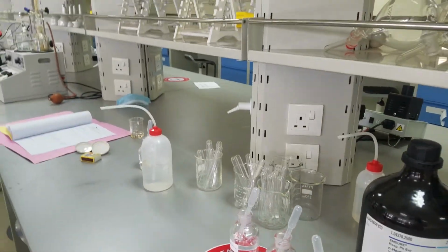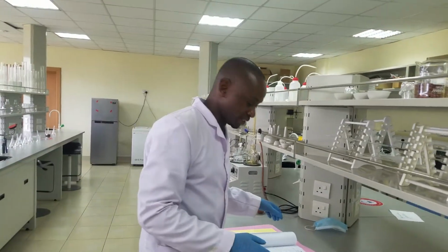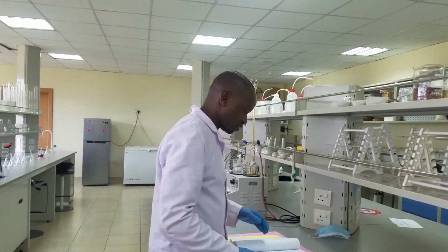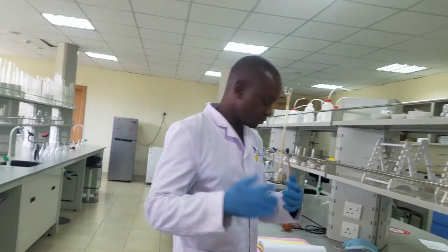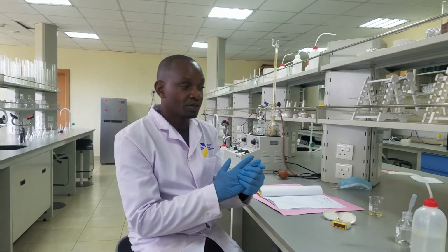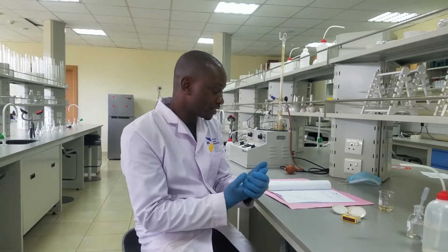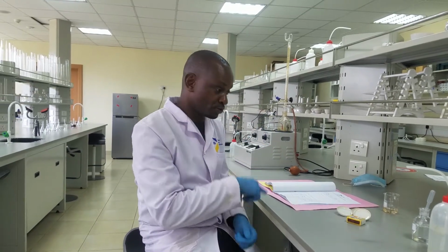So I would like us to go to our first experiment, and that is solubility in water. What I would like to advise you is, when we carry out this experiment, we will show you test tube reactions, and you yourself will be able to conclude by writing what you are seeing. For solubility in water, you are supposed to tell us, is it soluble or insoluble?